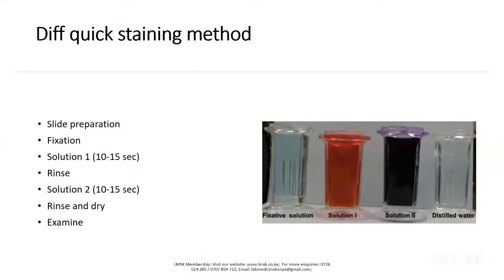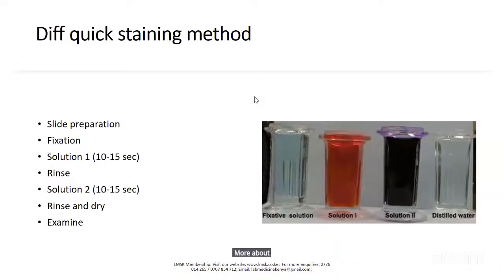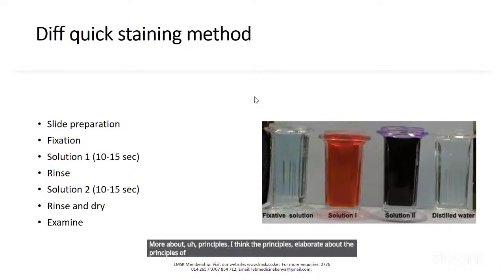Okay. Nelly, back to you. Thank you for that. Thank you, Christine. Abdul Fatah Abdullahi asked, he starts by greeting you, hello, asking about quick field staining. I guess this is DIFQuick. Yes. Staining technique on tissues. For me, what I know was about only PBF. Please elaborate more about the principles of DIFQuick in tissue staining.